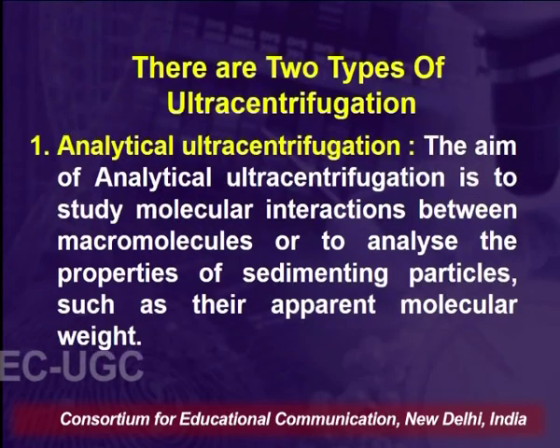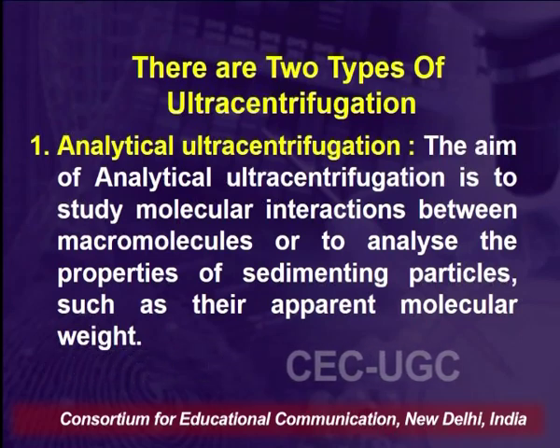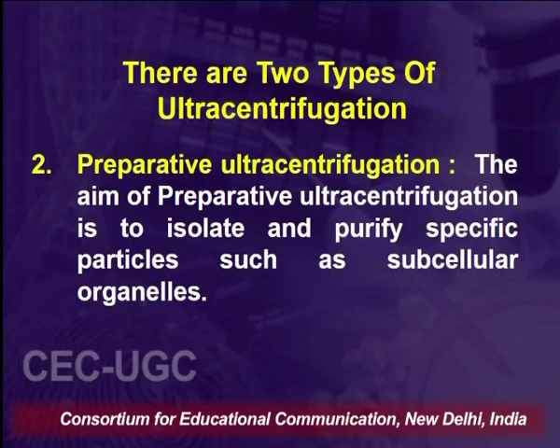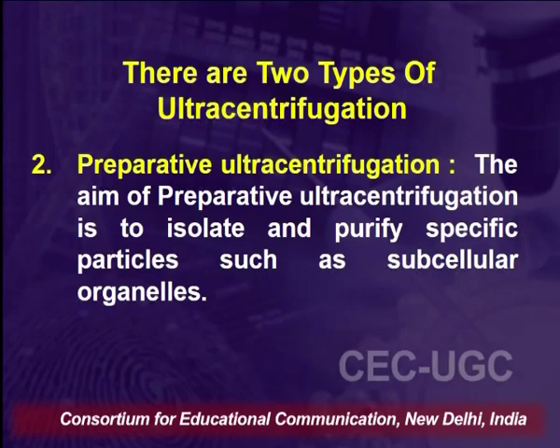The two types of ultracentrifugation are analytical, where the interactions between macromolecules can be analyzed, and preparative, where we can isolate and purify specific particles such as subcellular organelles.